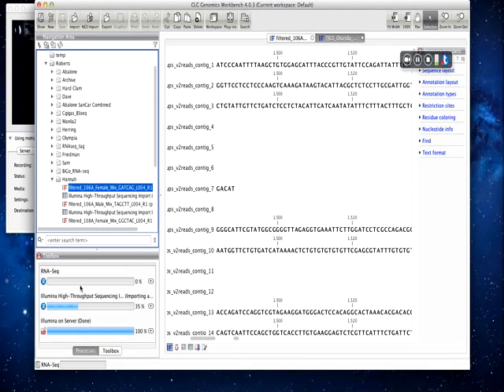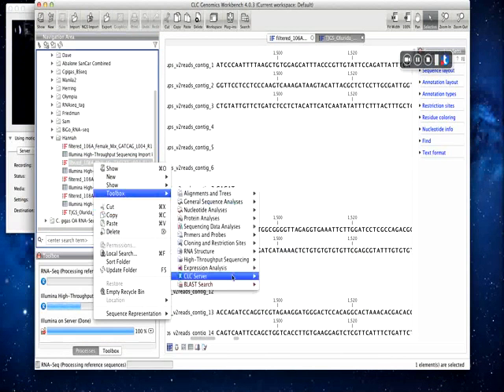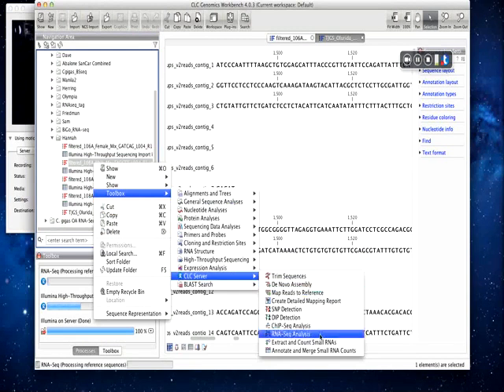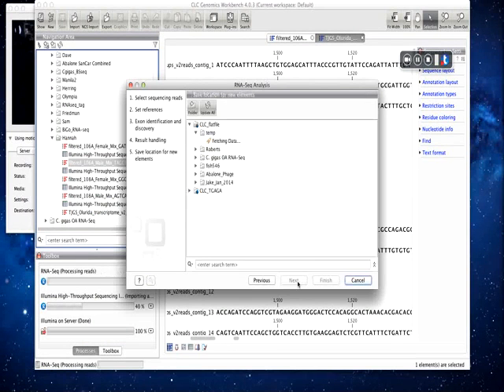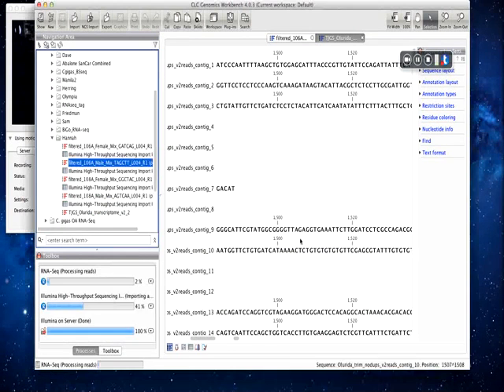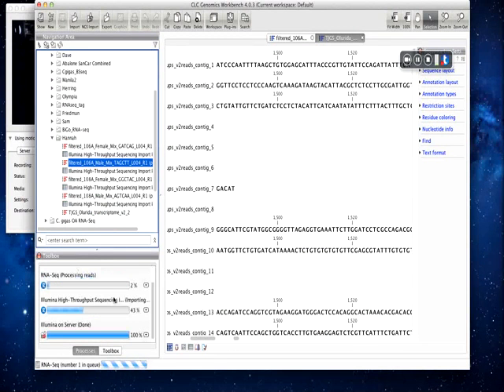Okay, so now it's starting an RNA-seq job on a node. I'll go ahead and do another one here. That's the advantage of using the server is you can handle multiple jobs. Alright, so it's got 2 nodes, so once the first job is finished, this job will start. And I'll show you what that looks like a little bit later on.